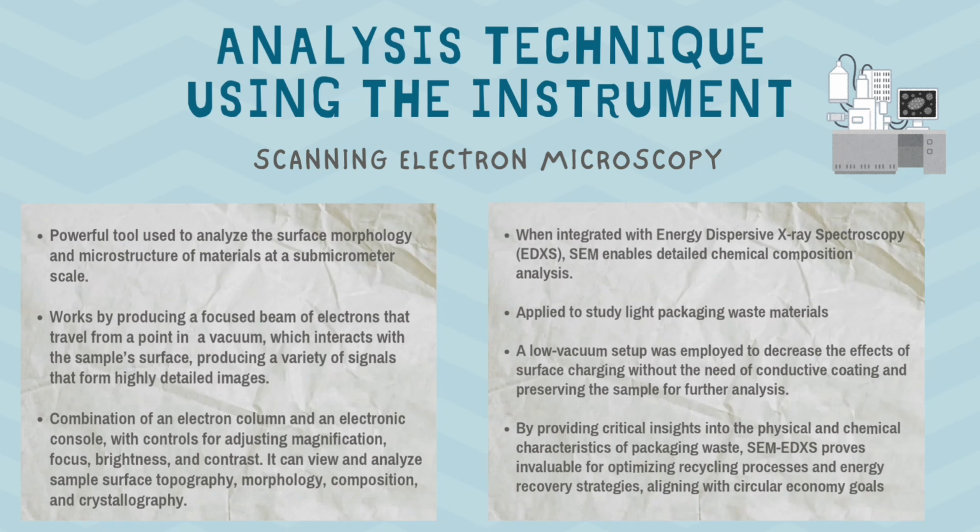SEM is a combination of an electron column and an electronic console with controls for adjusting magnification, focus, brightness, and contrast. It can view and analyze sample surface topography, morphology, composition, and crystallography. When integrated with energy dispersive X-ray spectroscopy (EDXS), SEM enables detailed chemical composition analysis.